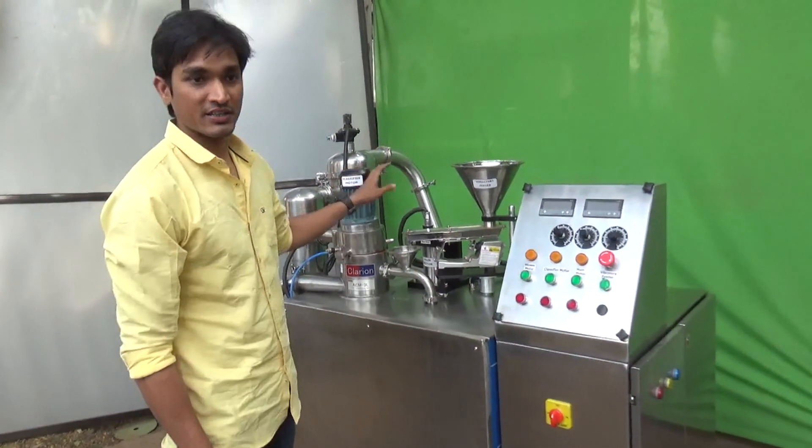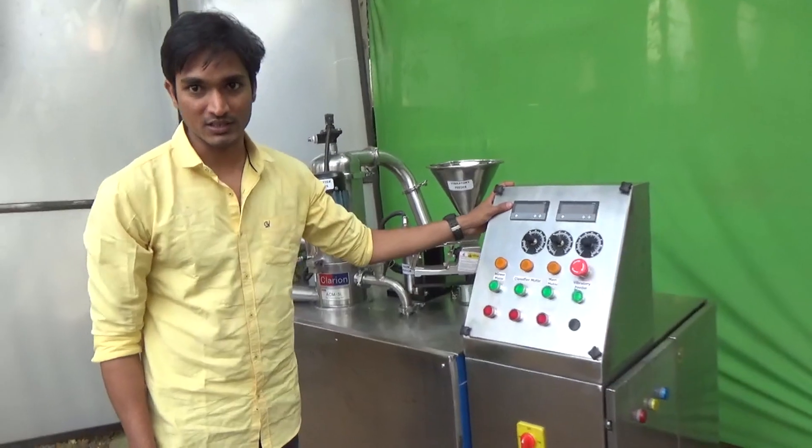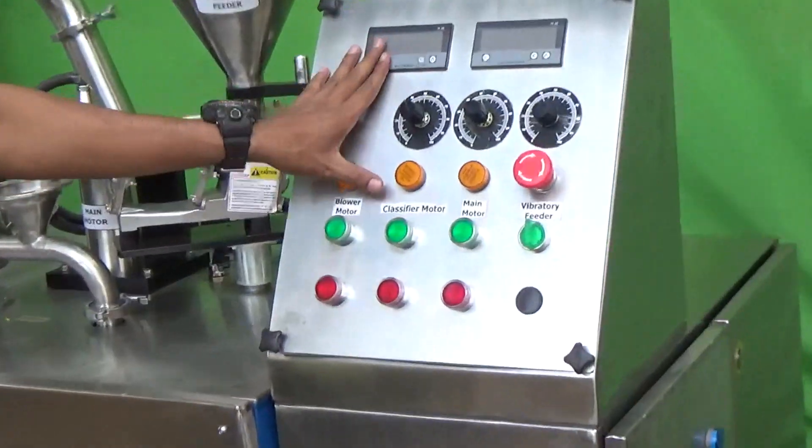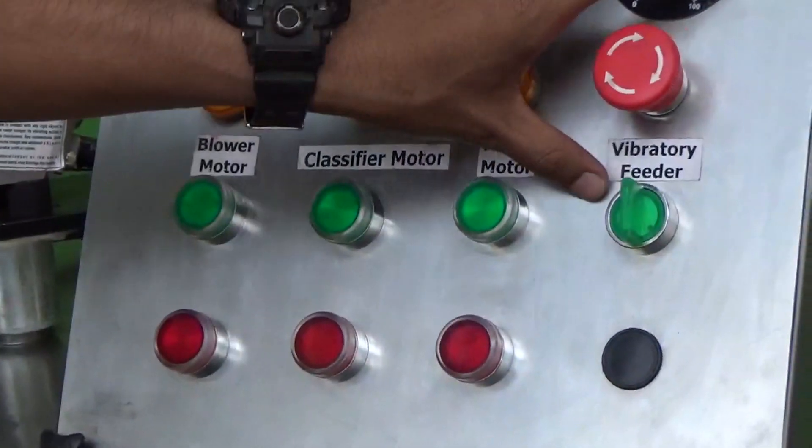This entire machine is controlled by this control panel. This switch allows the machine to start, and from here we can control the blower motor, the classifier motor, the main motor, and the vibratory motor.